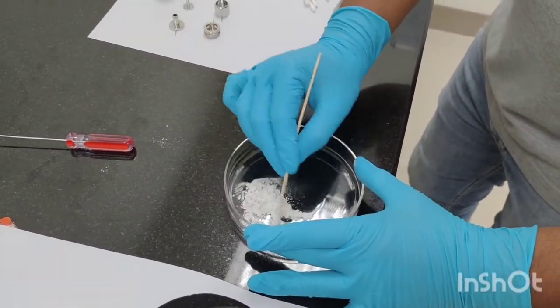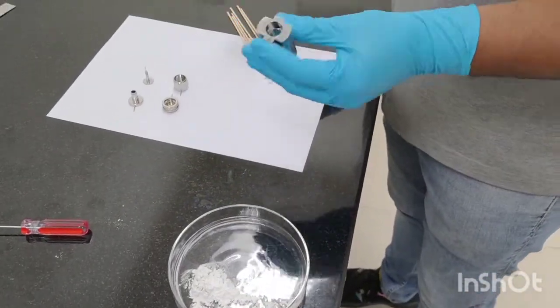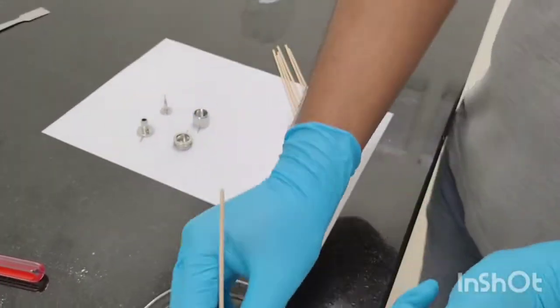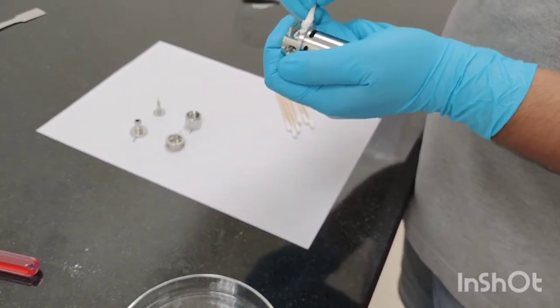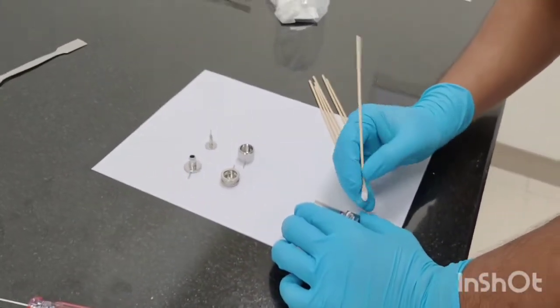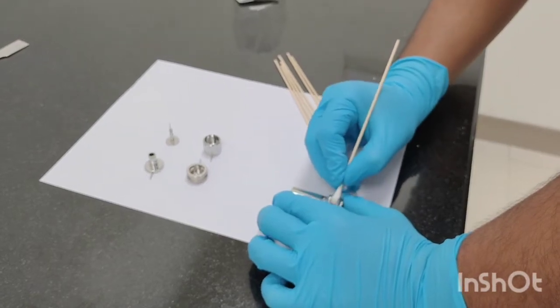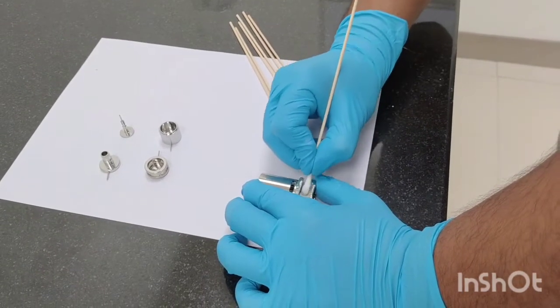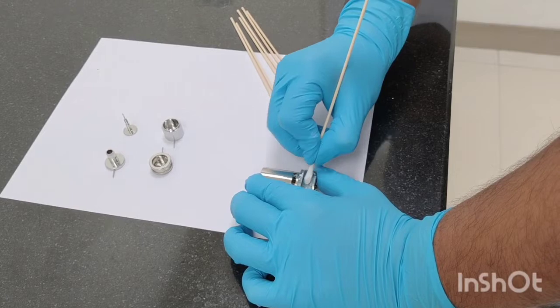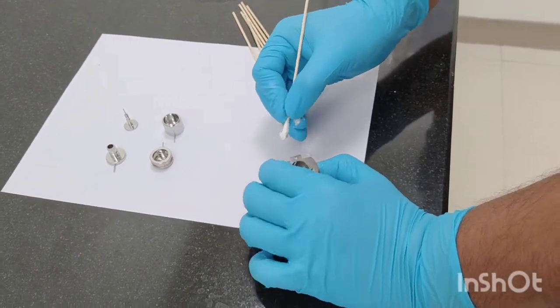We will be using this paste for cleaning the ion source. So one by one we take these parts — this is your ion source body. You can see this part has turned completely black, so we will take some amount of this aluminum oxide powder paste and rub it. We just need to rub it by pressing our hand and then rub so that the contamination gets removed. Luckily this ion source which we have removed is not that dirty.